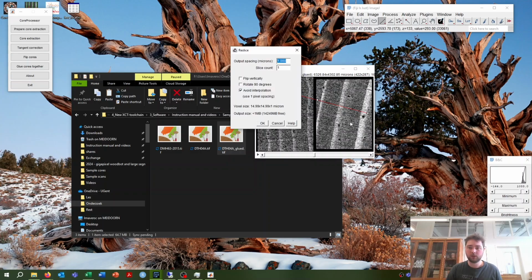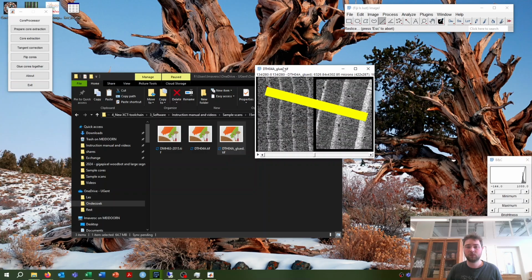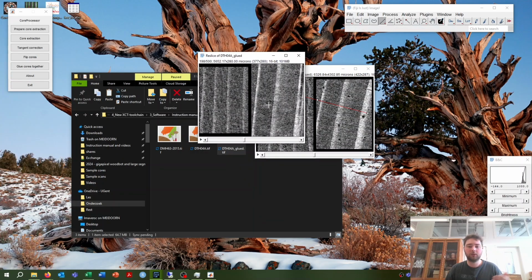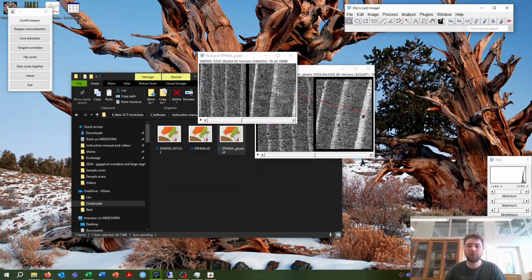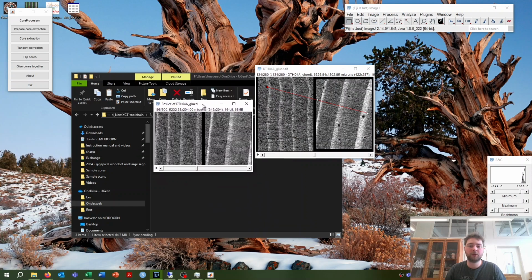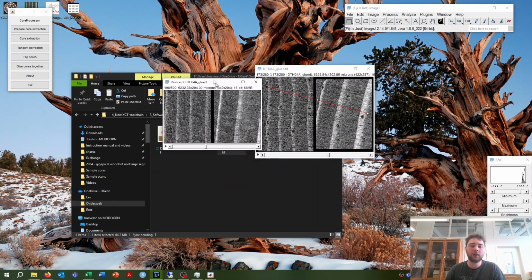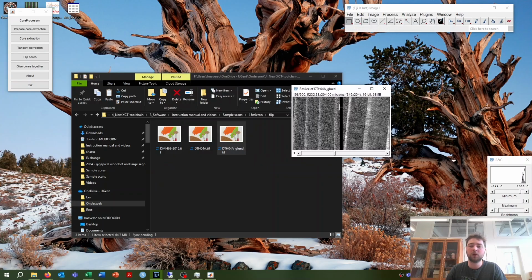For example, like this. Up. I'm gonna make 500 slices here. Okay. Fantastic. So I resliced it, and for example, I want to crop it also. So like this, and I go to Image, Crop. And this is now my new image, which is for some reason better. It's a fictive case here, but just to show, this is now my new image. I don't want this anymore, and I want to save it.